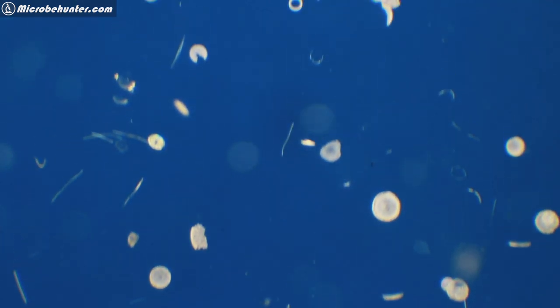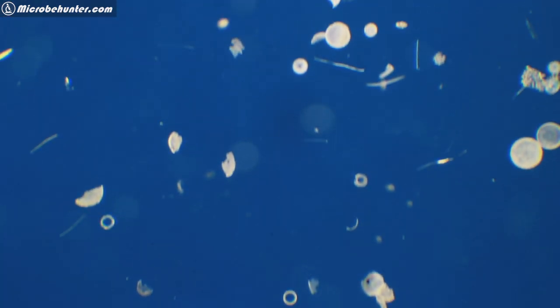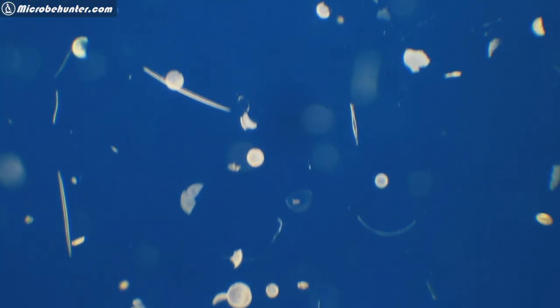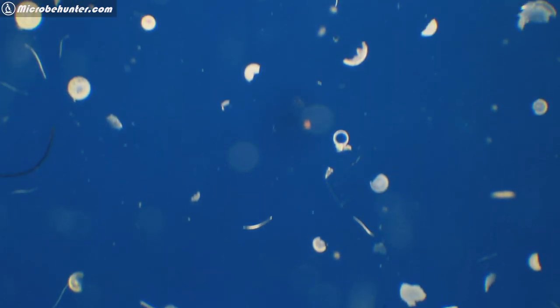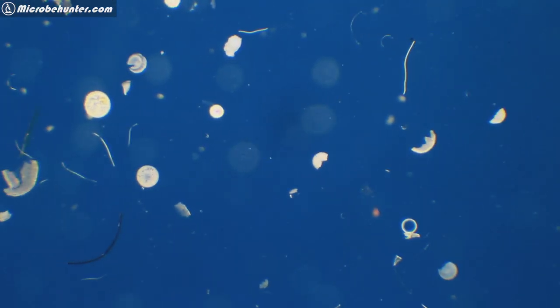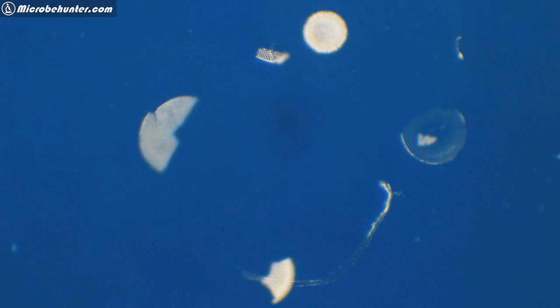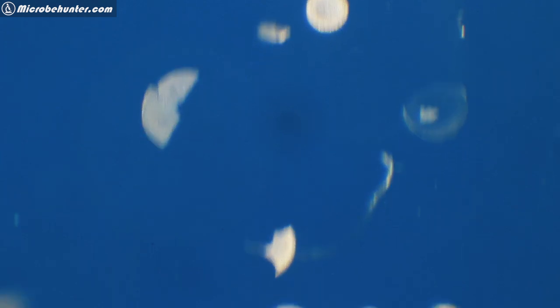At low magnification, I'm now using the one with the blue background. You can use nail polish, for example, or some, I don't know, colored pens maybe to make filters like these. I did make another video with some recommendations on how you can make your own filters. Yeah, but you see, there are plenty of things that you can experiment around with.